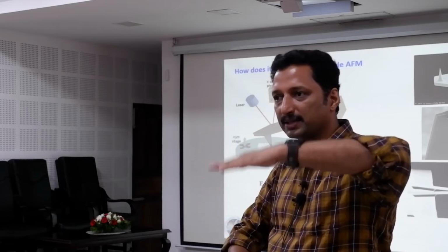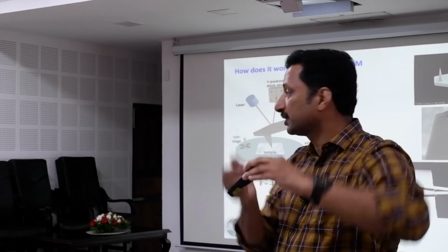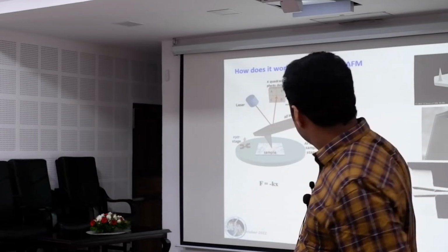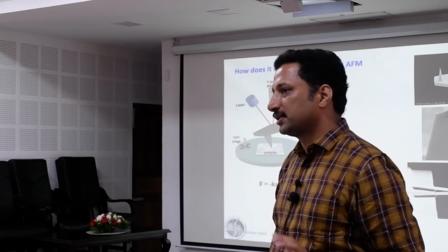It can only move like this, because if the tip is here and while scanning, if it is wobbling like this, you see that signal will go all the way. To avoid that, that's why this special geometry is there. The thickness also is special. All these are using FemLab or simulation tools.